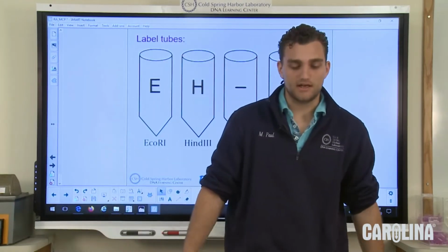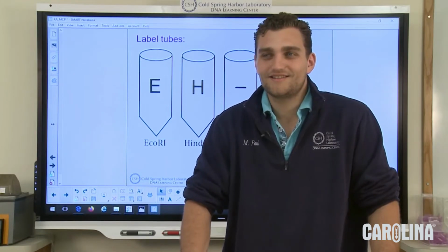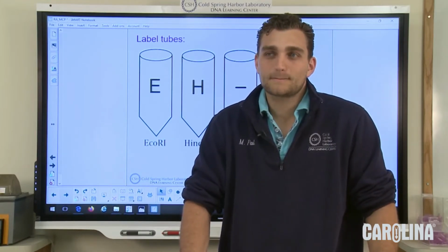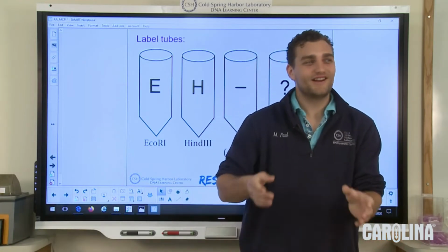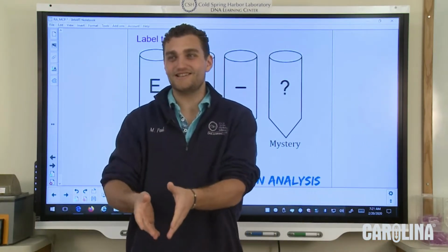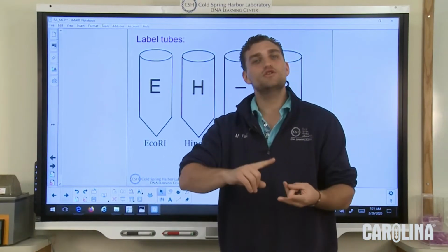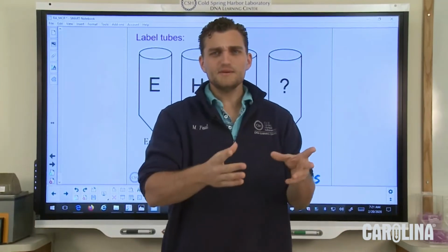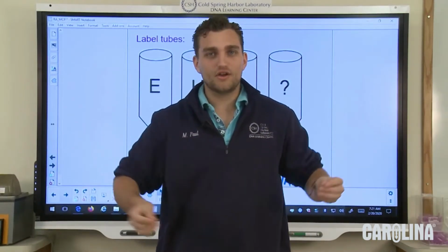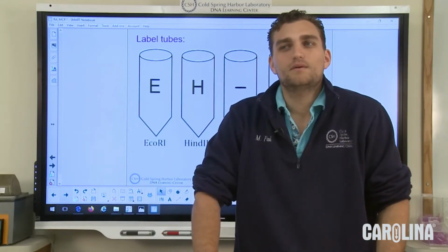So if I'm cutting DNA, what's one thing you think I'm going to need? What do you think? Don't overthink it. Yeah, DNA, awesome. So if you're working with DNA, you're going to need to cut DNA, and you're also going to need enzymes. So you're both right. You're going to need DNA, and you're going to need enzymes. Now, my question for you is, do enzymes just work at every pH? Are they going to work in really acidic, really basic solutions? What do you think?